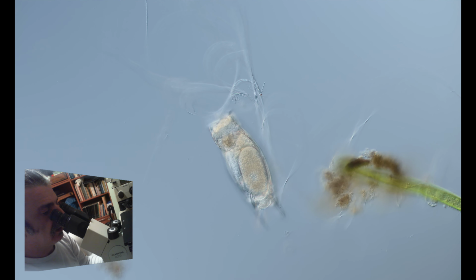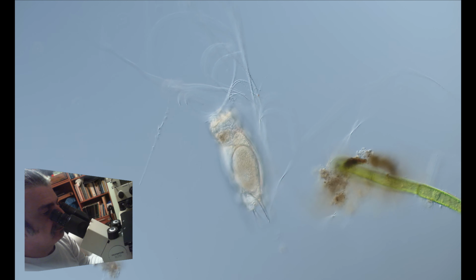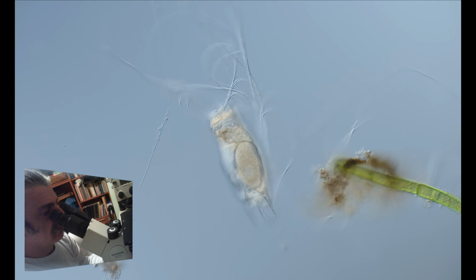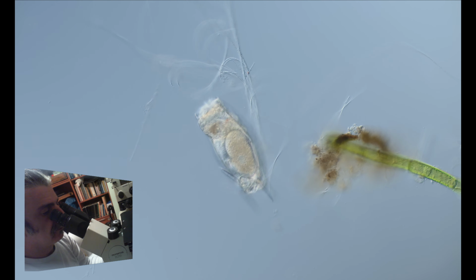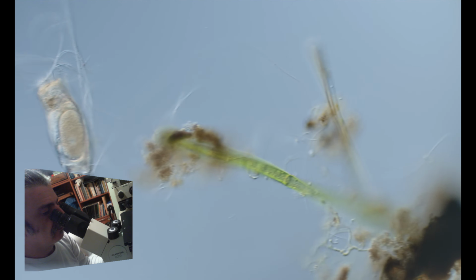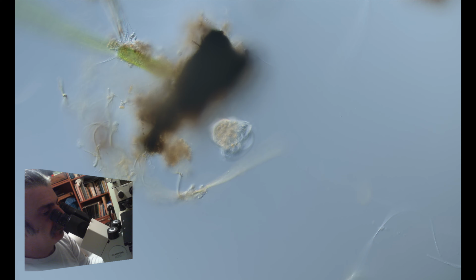You can see a red spot on its back. It's actually its eye. This one has an egg inside it. And here we can see another ciliate from the hypotrich family.